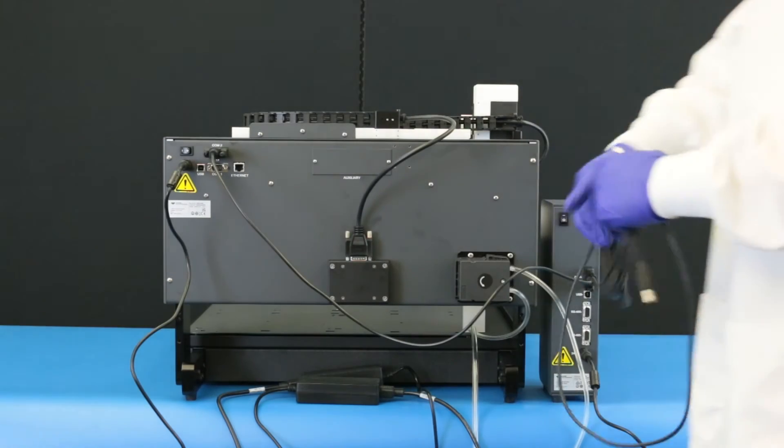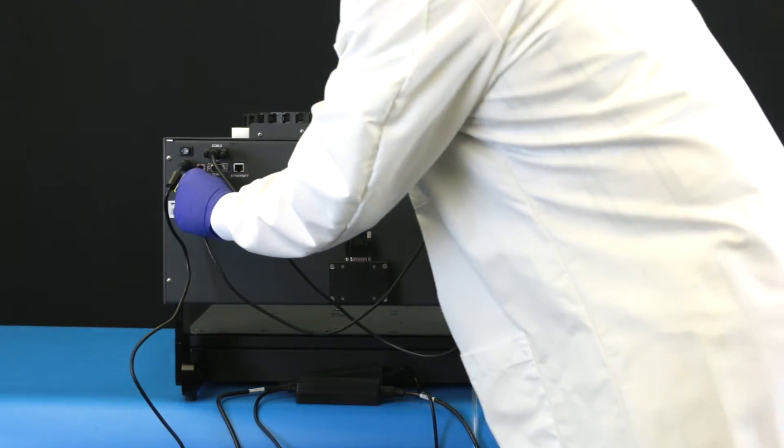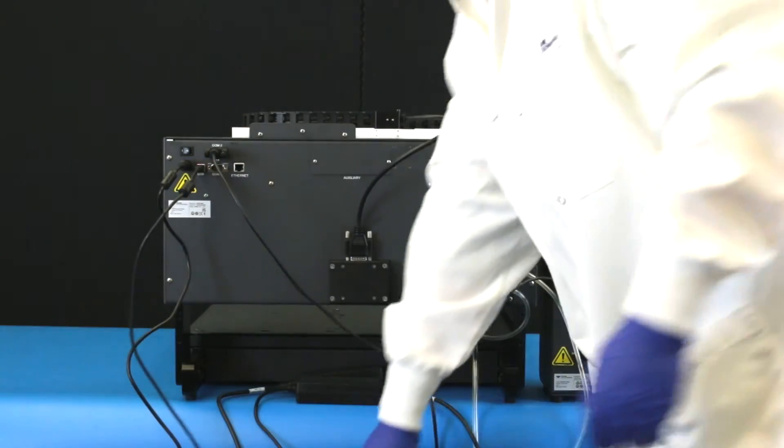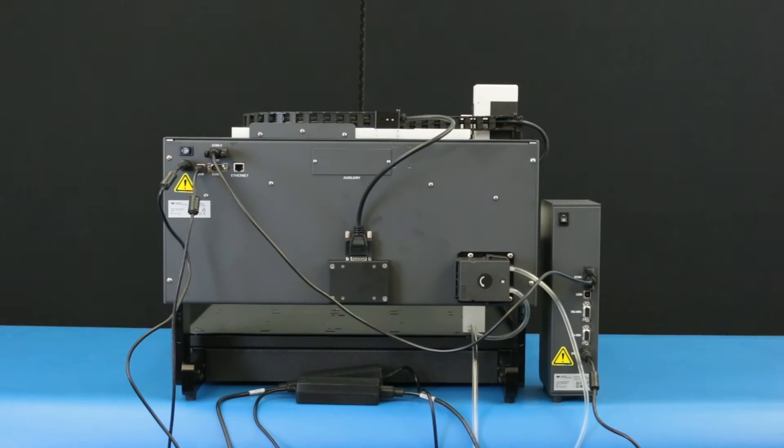Connect a USB cable between the computer and the autodiluter. Windows will automatically install the driver and assign a COM port number. Make a note of the number assigned.